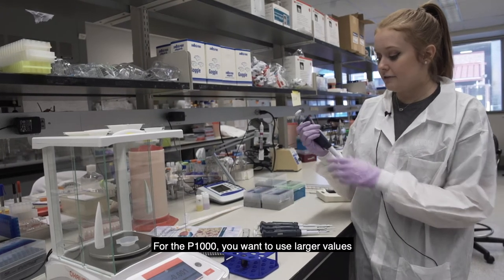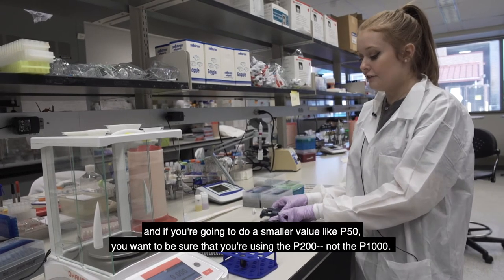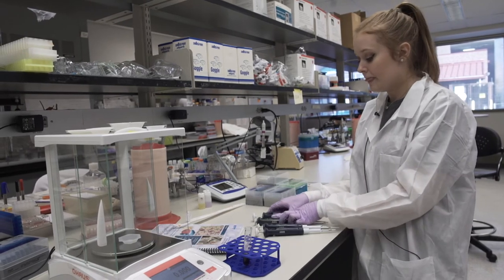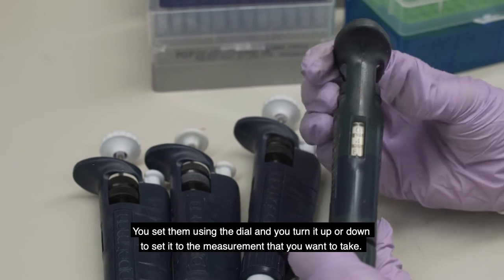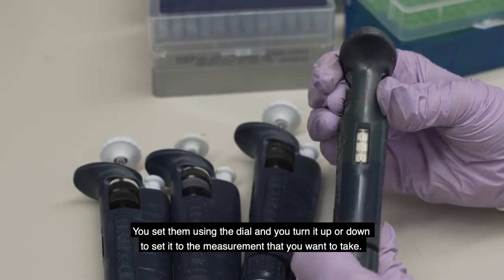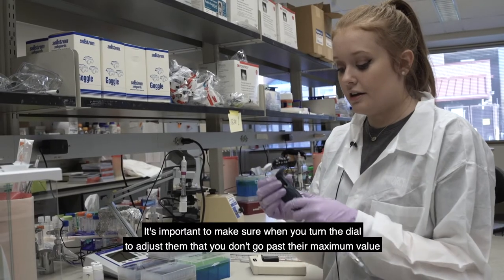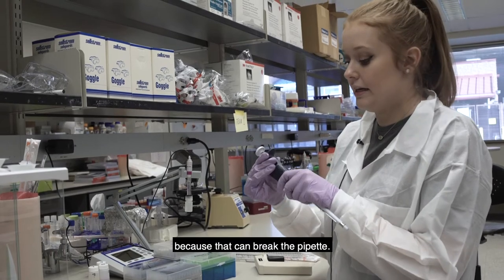For the P1000, you want to do larger values, and if you're going to do a smaller value like 50, you want to be sure that you're using the P200, not the P1000. So you set them using the dial and you just turn it up or down to set it to the measurement that you want to take. So it's important to make sure when you turn the dial to adjust them that you don't go past their maximum value because that can break the pipette.